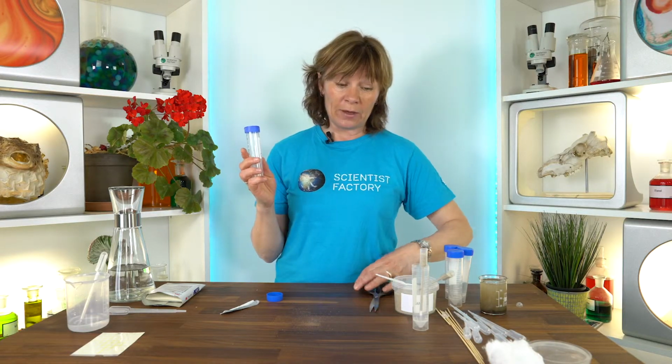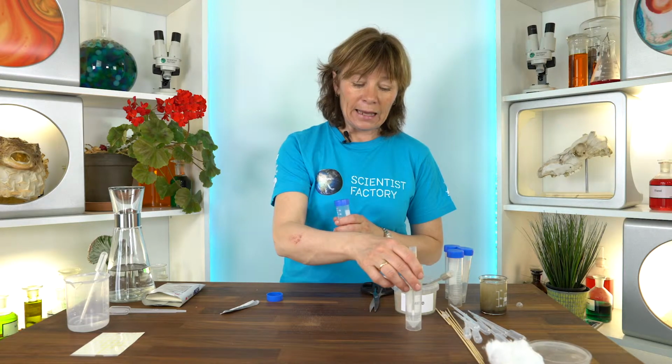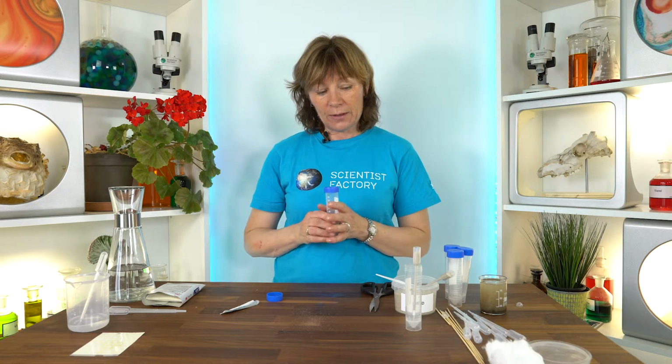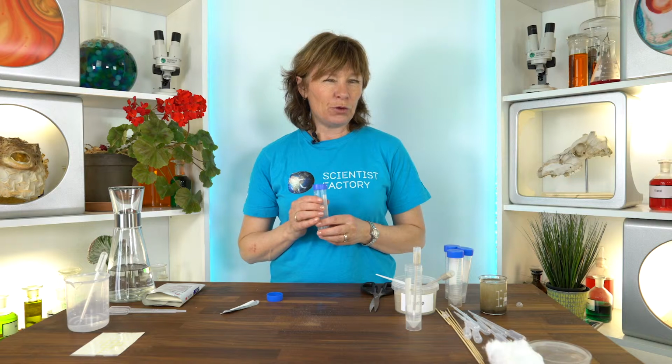For example, you can take several samples through your column, and then you take 1 milliliter, and maybe in 1 milliliter you have no chlorine, then you add 1 drop, 2 drops, 3 drops, etc. But the idea here is that your students will work in groups and have one leader that coordinates all the ideas that the other students have. If you feel that your students are not mature enough to organize this, you do it all together, step by step.